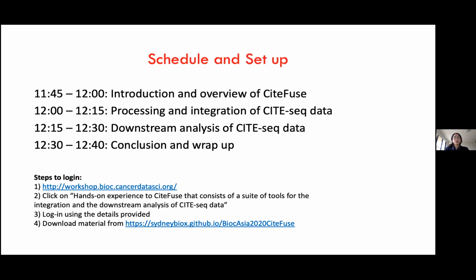So the setup and schedule for today's workshop is a brief introduction on CiteFuse and CITE-seq data. And then we'll move on to performing the analysis using CiteFuse, of which there are two major parts: the pre-processing and integration of CITE-seq data, and then all the downstream analytical components of CITE-seq. And then we'll wrap up with conclusions and Q&A. And again, if at any point people have questions, please leave a message in chat or unmute yourself.